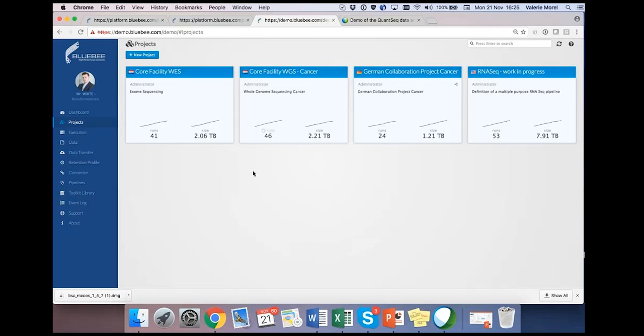So far, the output will be the gene counts per sample, but we are also working on a differential expression analysis pipeline, and we will integrate that too, so that you can specify your samples and then compute the differential expression on that.